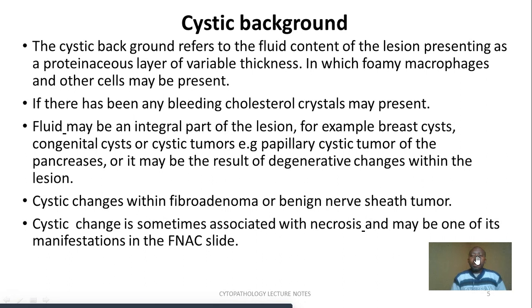Foamy macrophages, we shall look at how they appear, but just like you hear the word foam, if you have looked at foam with soap, they have in their cytoplasm an appearance which looks like foam. So that's why we call them foamy macrophages. Most of the time we find the macrophages are vacuolated because of those foamy appearances. We find the vacuoles formed in that.